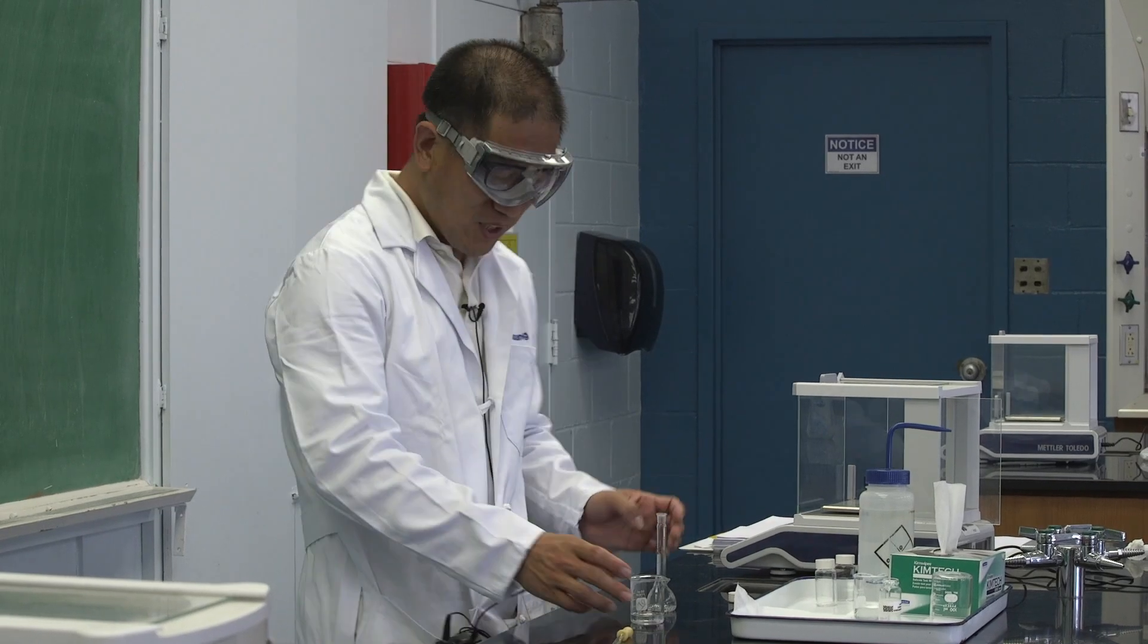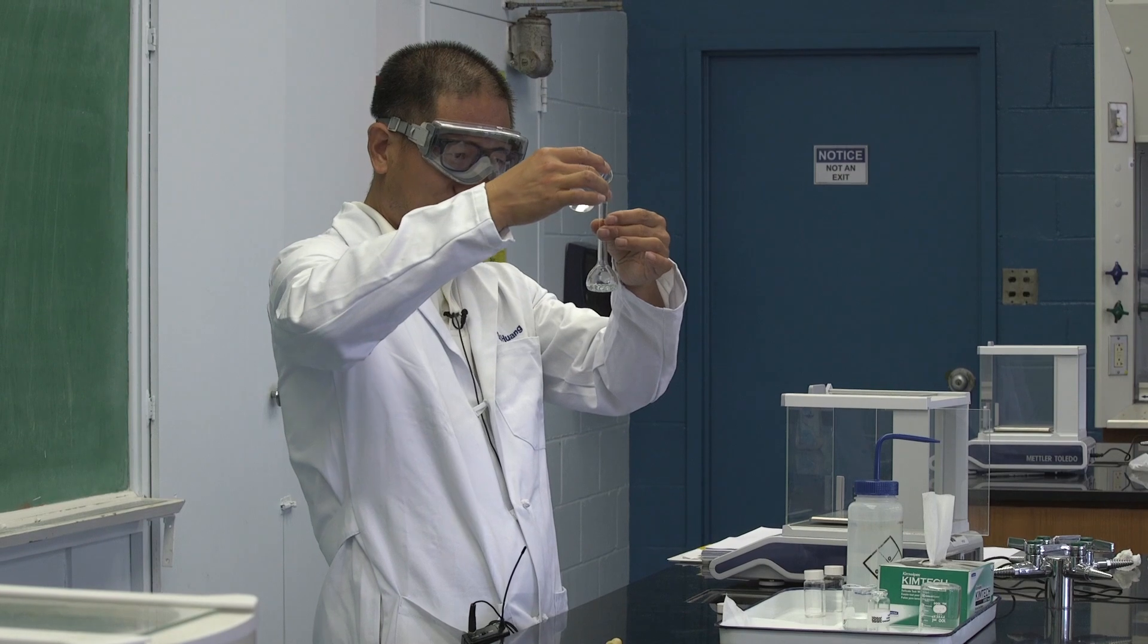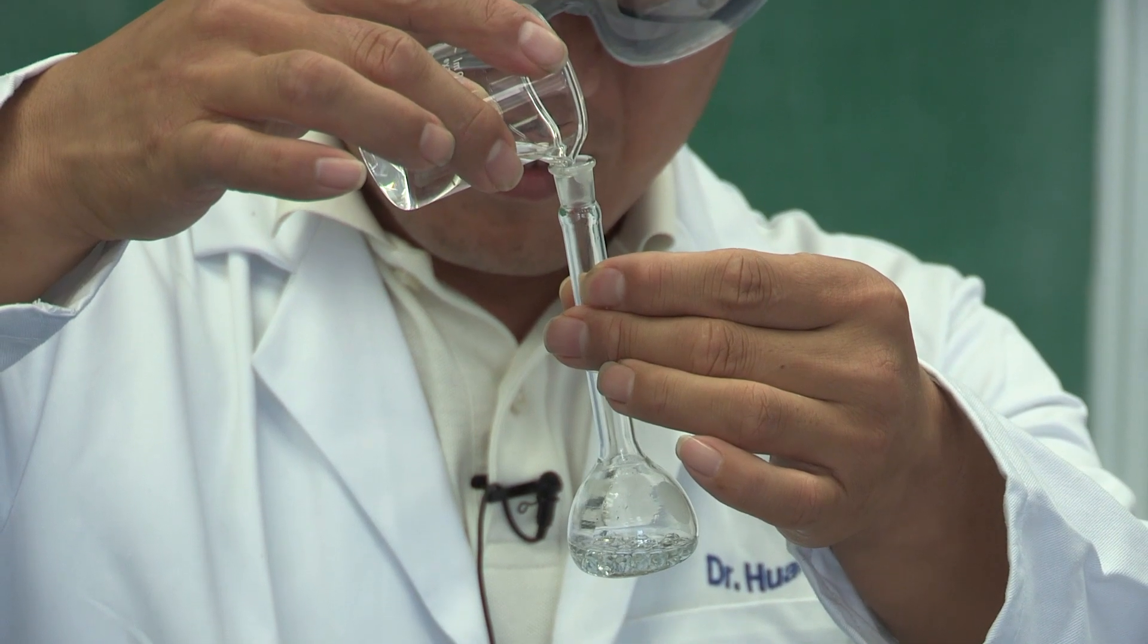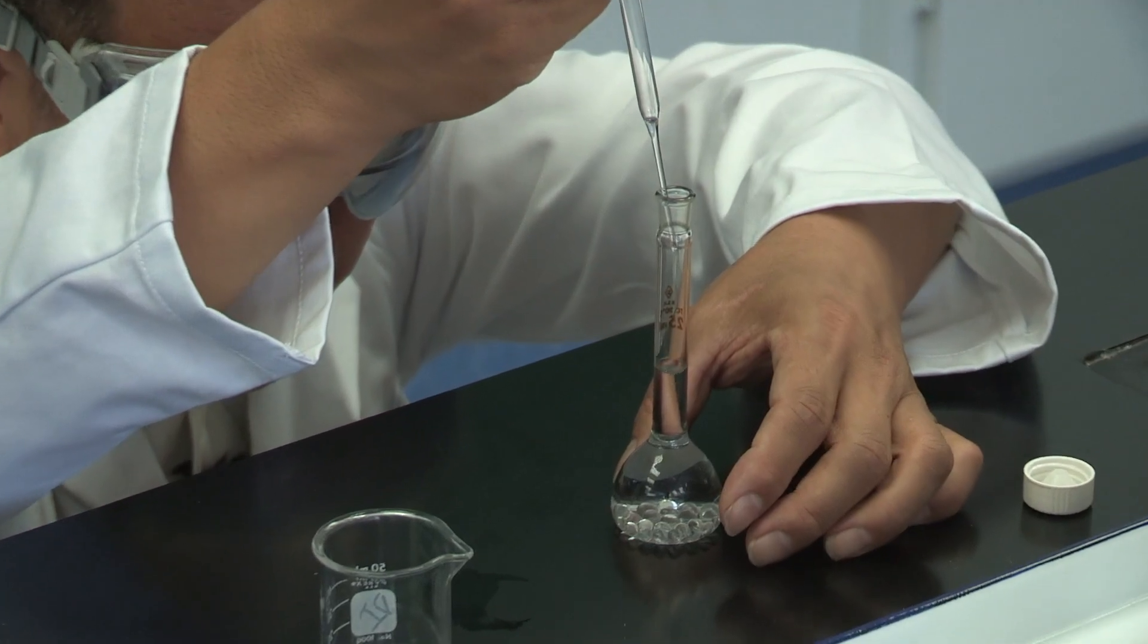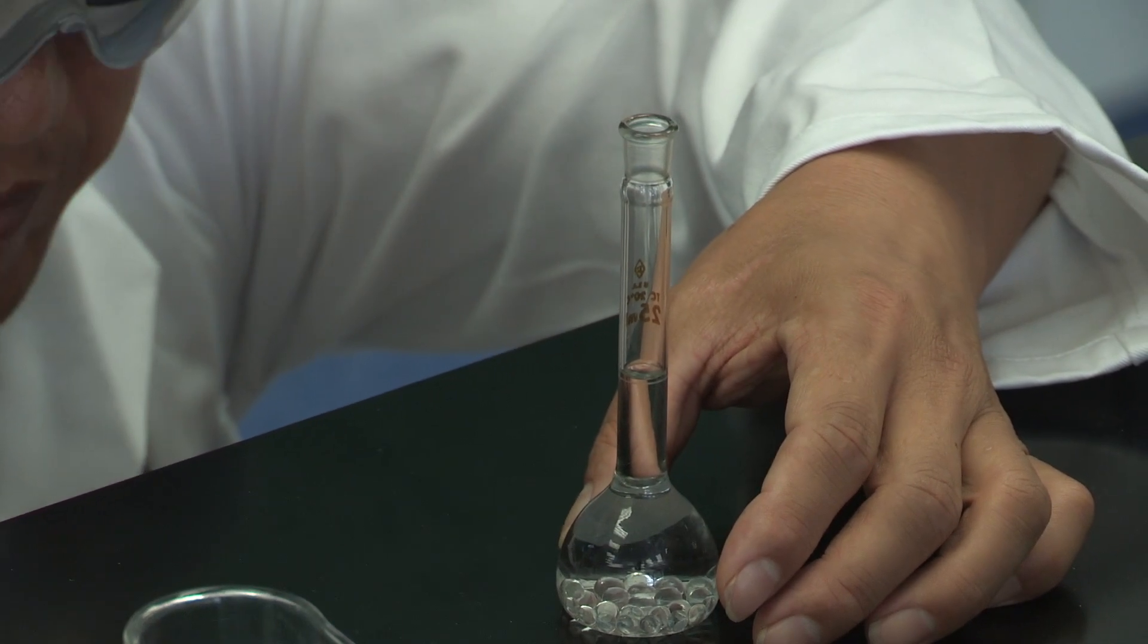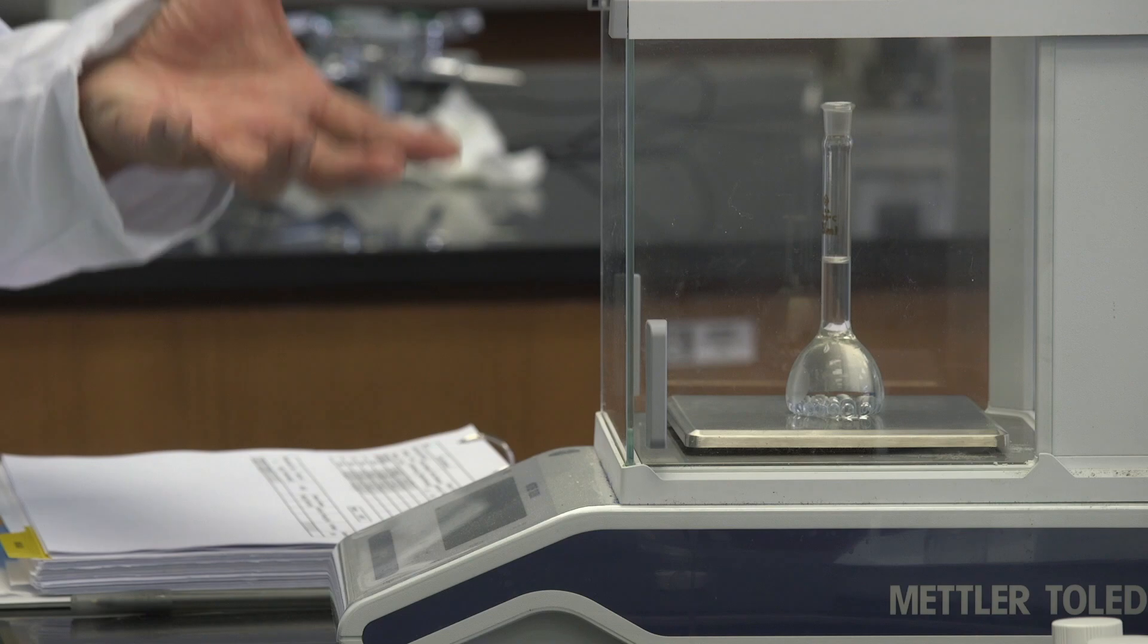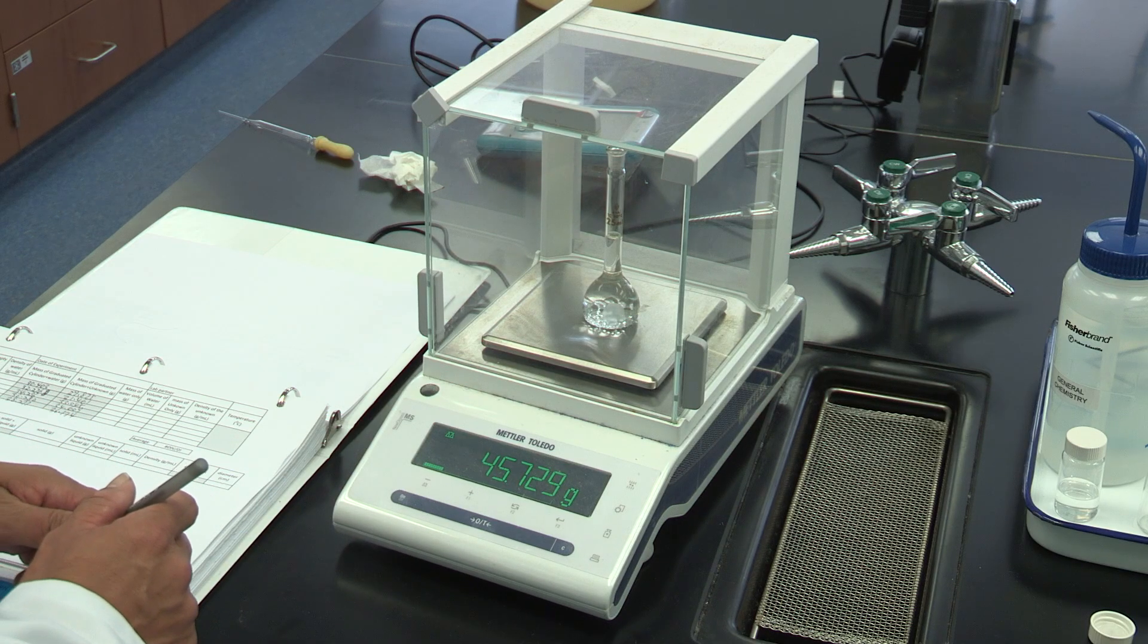Then, we add some unknown liquid to the volumetric flask. Then, we will get the total mass, everything together, which includes the flask, the bead, and the unknown liquid. The reading is 45.729 grams.